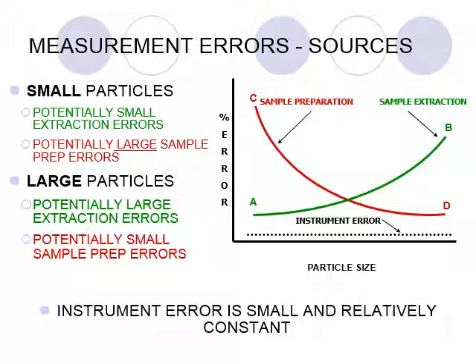The same thing can happen in your particle size samples. So you need to make sure that when you take a sample, you take it from a reasonably well-dispersed location. You need to shake the jar, shake the bag. You need to make sure that things that are shipped to you haven't settled. You need to make sure that you take a few measurements so that you're representing the population well. So those type of sample extraction errors can really matter, especially for large things because of that settling behavior we've talked about and in segregating populations.